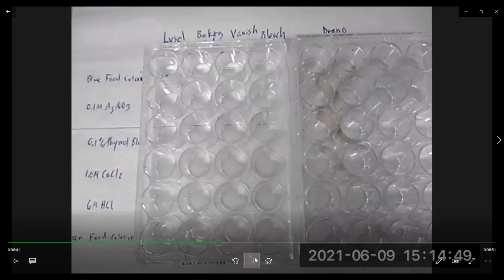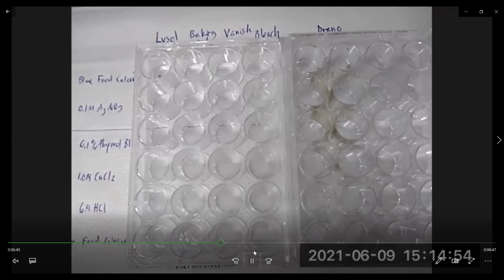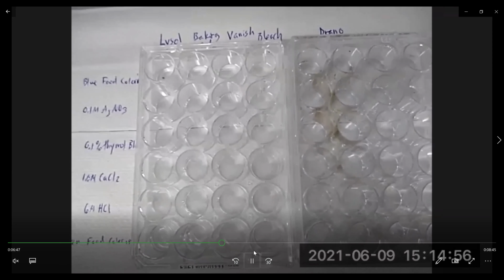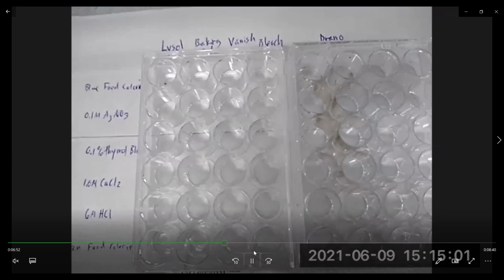So anywhere from 5 to 10 drops of your household chemical is put into the cell well plate. So she's taking each household chemical, adding it to the cell well plate.